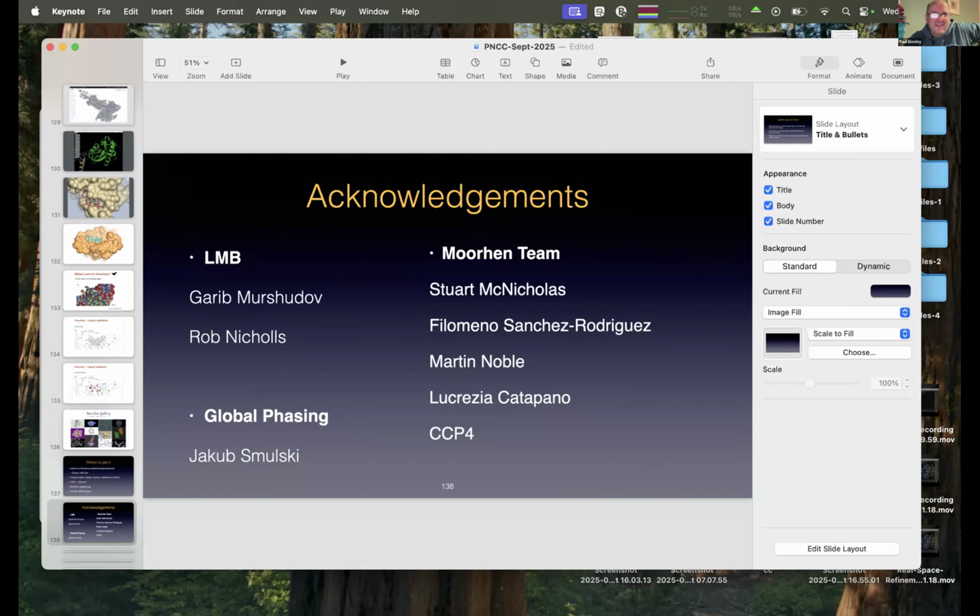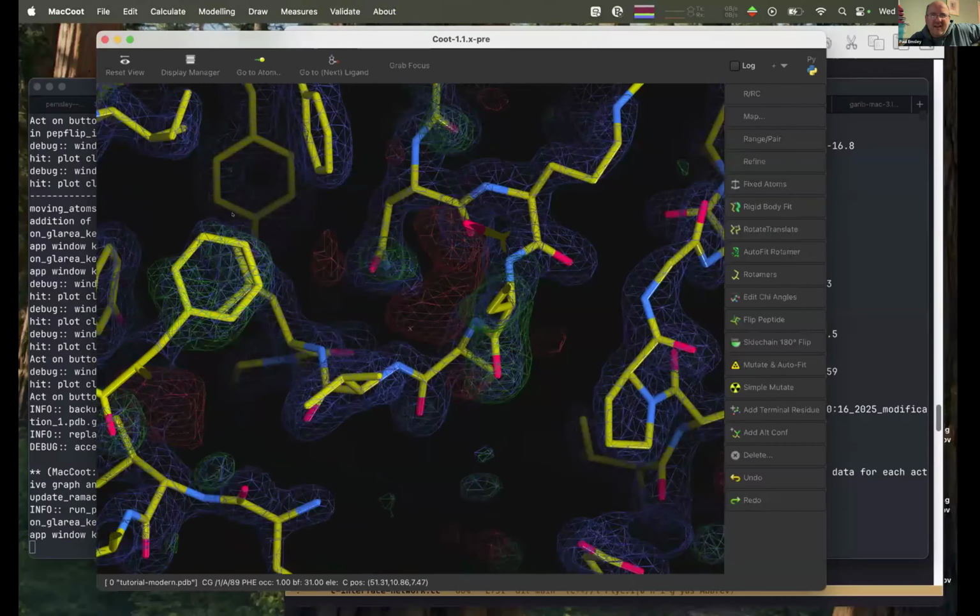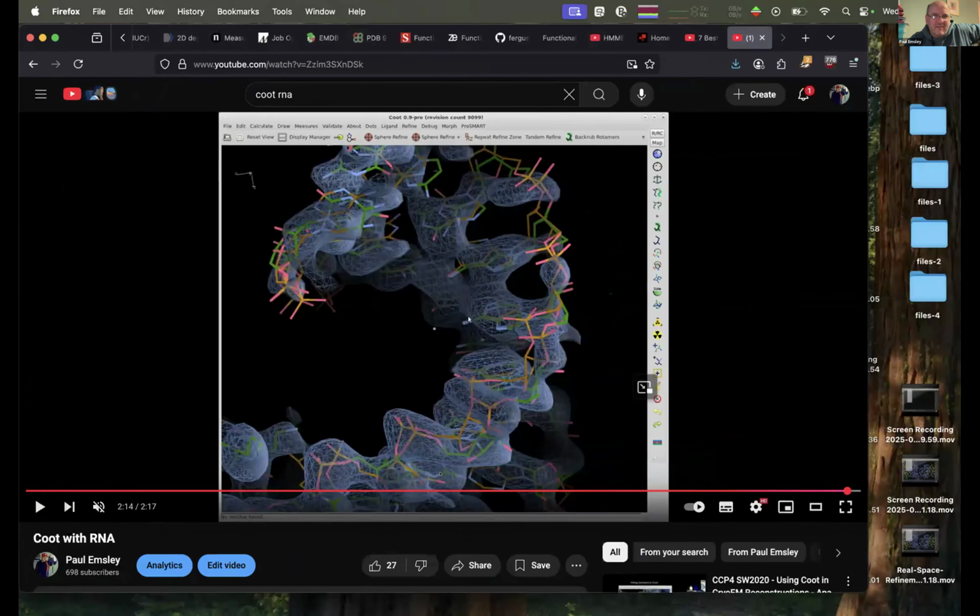Well, we can't see the YouTube window. You can't see it because I'm not sharing. Oh no! Oh, thank you. Sorry, I'm wasting your time. Oh, no. At least we know where to look. Let me, okay, let me just, if I've got 10 seconds. Where's my zoom? Zoomy zoom zoom. Is this what I want to do? Share? Is it this one? Right. If I take it back, yes.